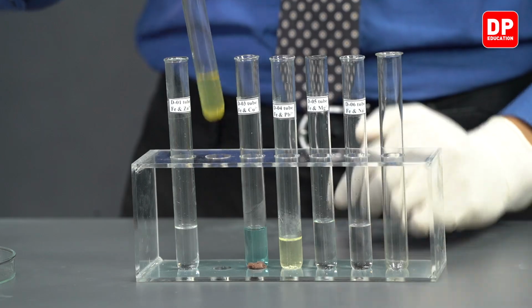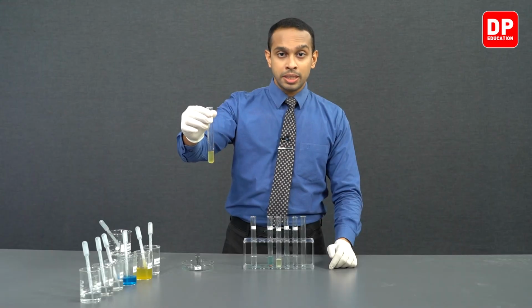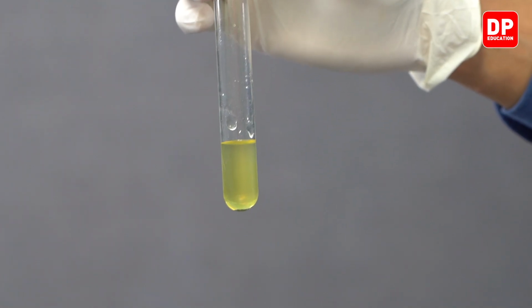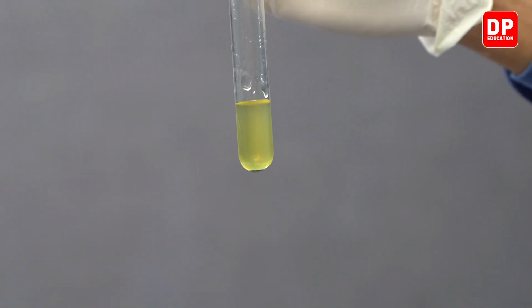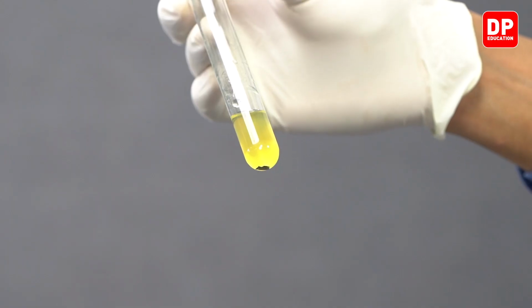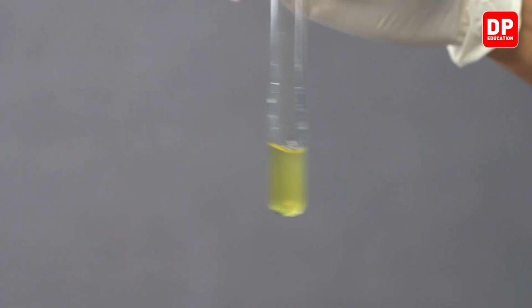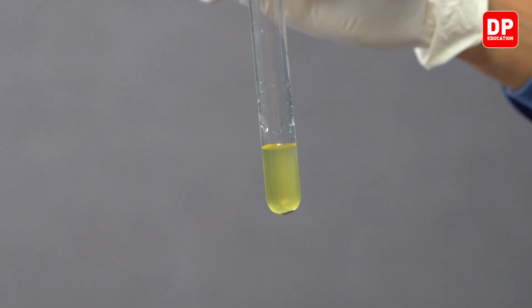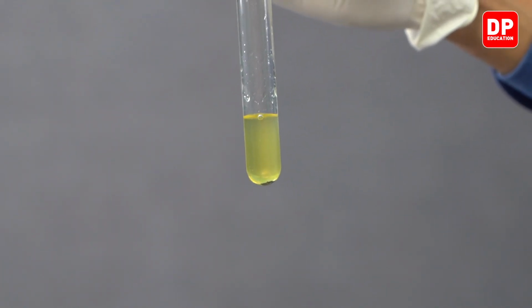Then we move on to Fe2 plus aqueous ion solution, or ferrous ion solution. You can see the ferrous ion solution has not undergone any change. At the bottom of the solution, you can still find the metal piece that we added. There has not been any change, no color change, and we don't see any precipitate being formed here as well.